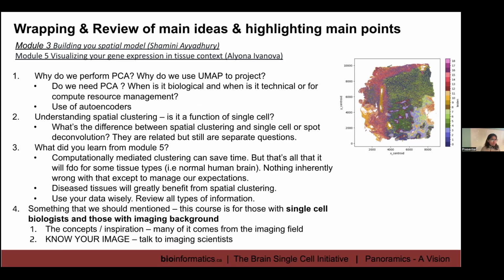So that is where you look and review through your H&E. You look and review through your image. The H&E is there. You're using the H&E to pick your ROIs, so you pick that ROI for a reason because it was an interesting choice. It was an interesting region to pick. So why not just use it because it is there?